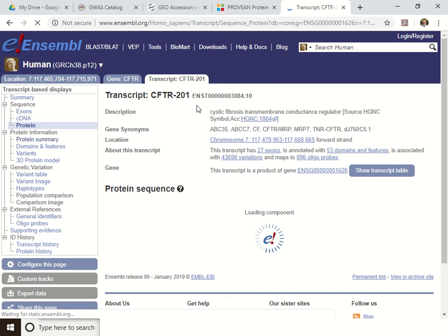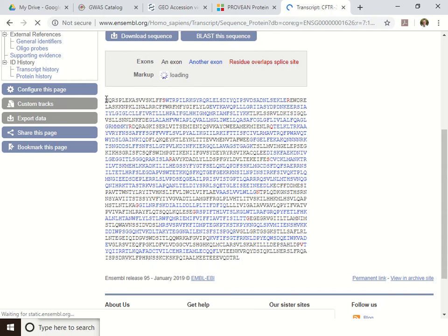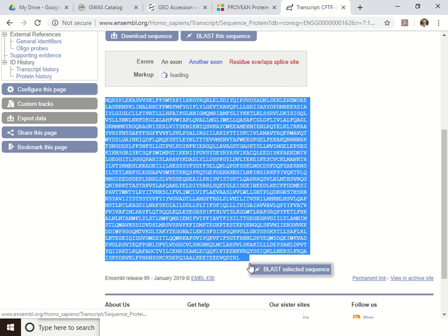Okay, great. There we go. Look at that. So do you think that I can just grab this whole thing? That's good stuff. All right, I'm now going to copy that to the clipboard. Coming up to Provean here. Now it says it wants FASTA format.